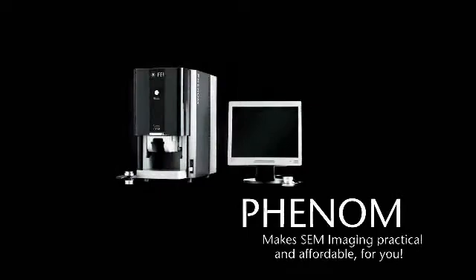At last, Phenom makes SEM imaging practical and affordable for you.